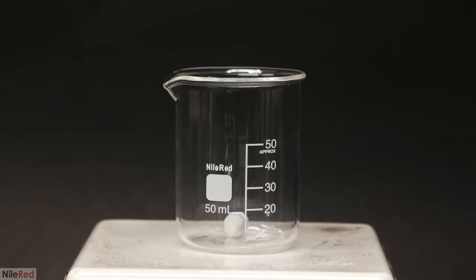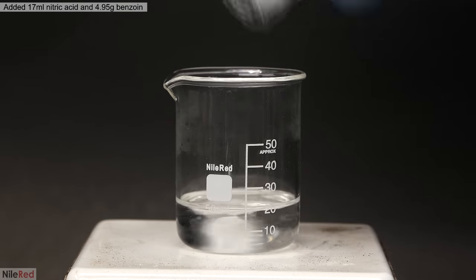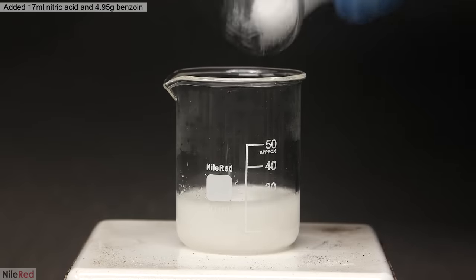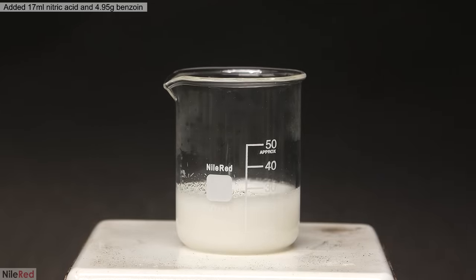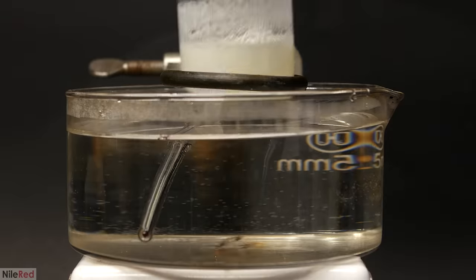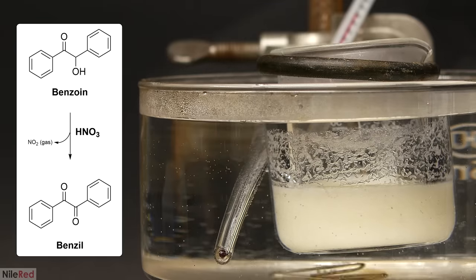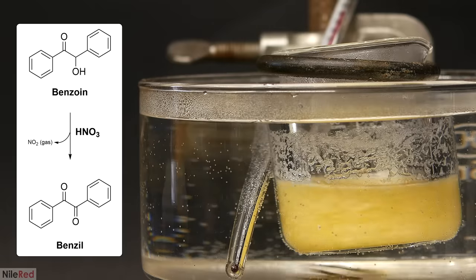The next thing I needed to do was to oxidize it to benzil. Into a beaker, I poured 17 mils of concentrated nitric acid, and added the benzoin in small portions. I let it mix for a couple minutes, and then I put the beaker in a water bath at around 70°C. As it heated up, the nitric acid started reacting with the benzoin to make benzil and nitrogen dioxide gas.